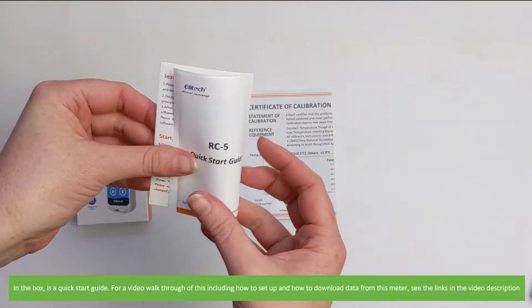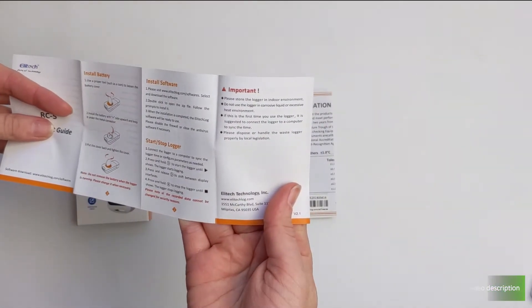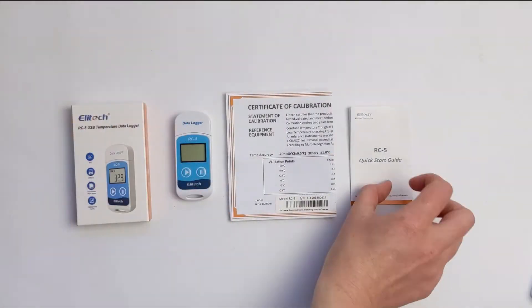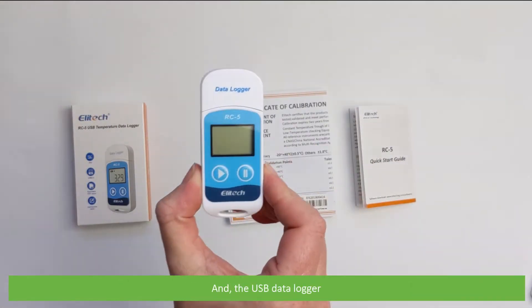In the box is a quick start guide. For a video walkthrough of this, including how to set up and how to download data from the meter, see the links in the video description, a certificate of calibration, and the USB data logger.